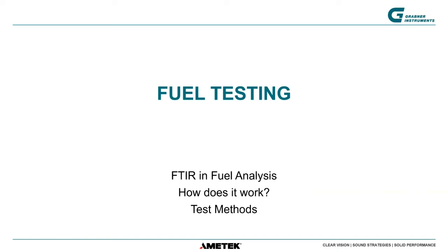This is what I wanted to show you about Flashpoint, and now we are getting a little bit more into a generic product, fuel testing by infrared analysis. First, I want to show you how this infrared analysis works and what it does in fuel analysis, how it's working with our IR vision, and what test methods we have and what they are.